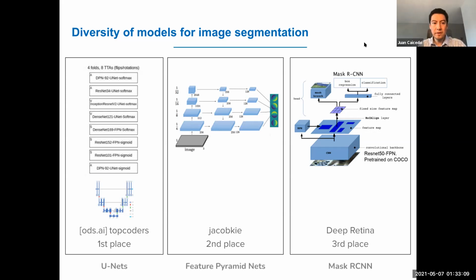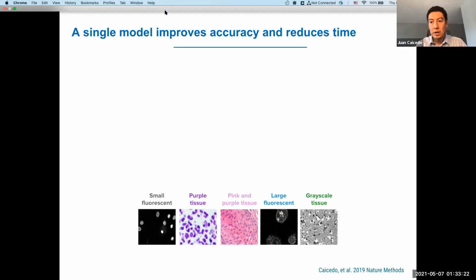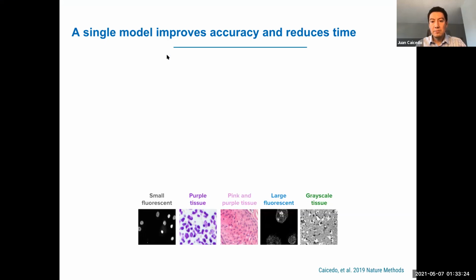Cool. So with those three, one of the things that we really wanted to evaluate as well, beyond accuracy only, is what are the improvements that we get in facilitating biologist research. In this case, imagine that we have 100 images in these 5 types, and you have a biological lab, and you have to segment the cells in those 100 images this week.